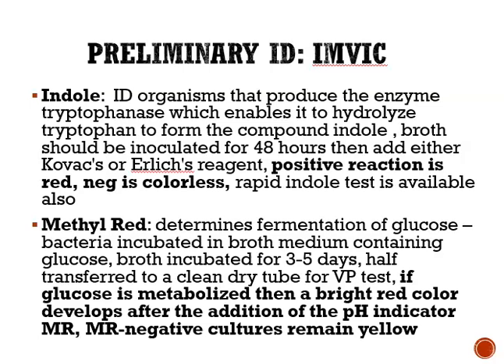A positive reaction is going to be a pink to red color. Negative is no color change. They also have rapid indole tests available that are similar to the oxidase test, where it's done on filter paper.